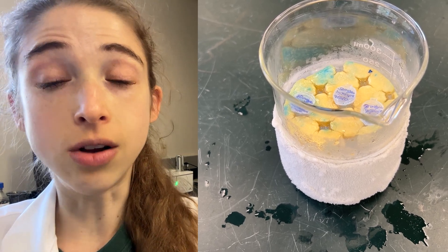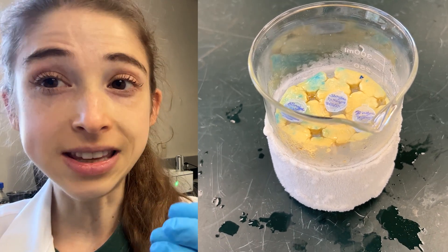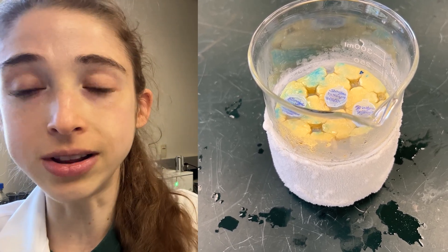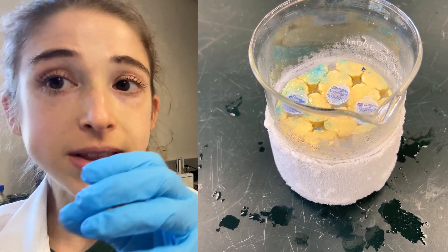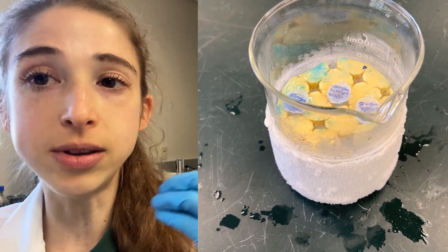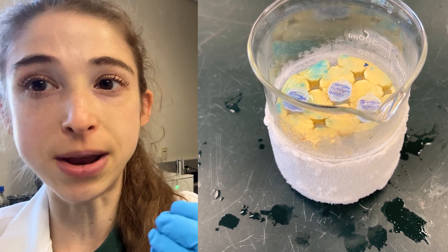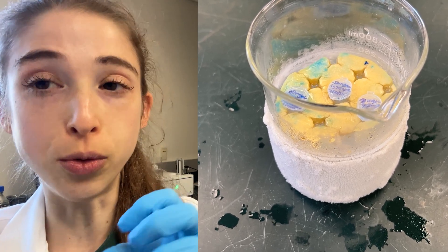What's really good about these alcohols is not only do they have that low freezing point, but they also have a high heat capacity. They're good at taking in a lot of heat without heating up too much themselves — we don't want them to get hot and stop cooling our sample. They can hold a lot of heat without raising their temperature too much, and they conduct heat a lot better than air. So this is a lot better than just sticking your sample in the minus 80 — you're putting it in a really cold liquid that actively pulls heat out.